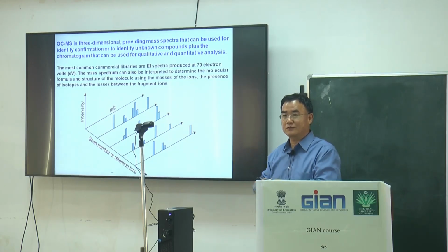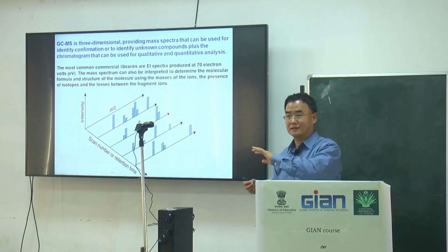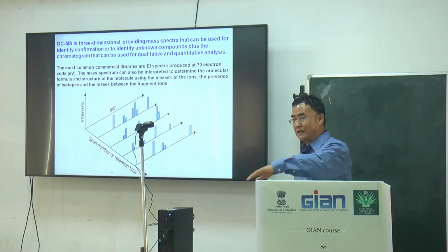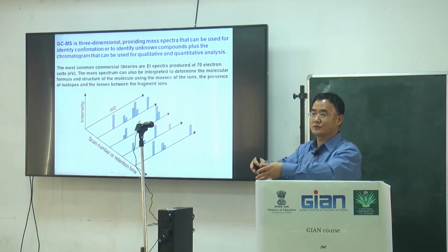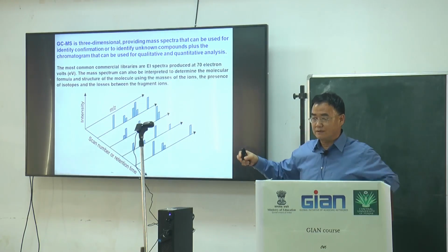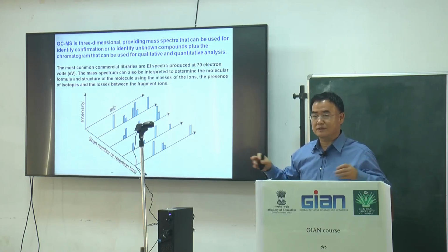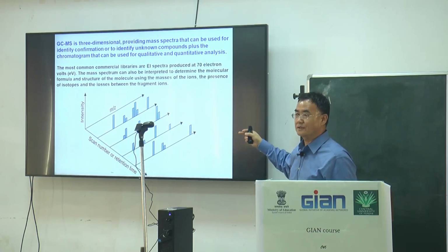Yeah, we make the ester. Under acid, the methyl group is added to the acid and removes one water molecule. That generates ester. The ester is an even larger molecule, but still it can be evaporated, so it can be analyzed with the GCMS.